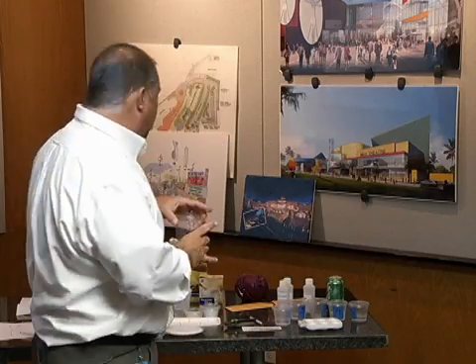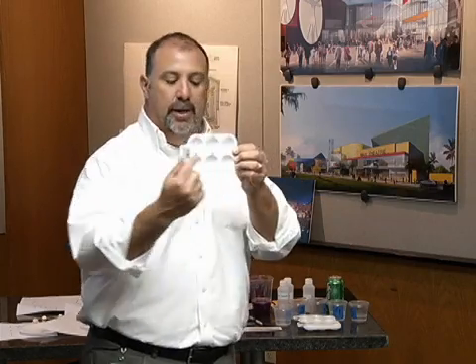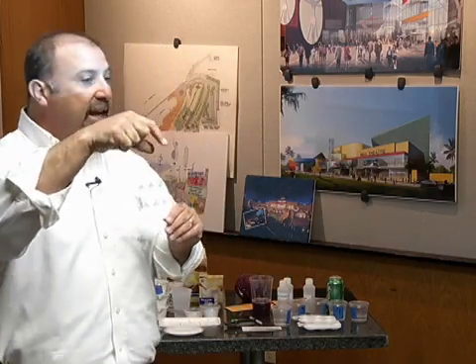You have these little paint palettes, and you're going to take the little grease pen and mark each of the little trays 1, 2, 3, 4, 5. That's going to correspond with the chemical. You're going to go around, and there are little droppers inside each of those chemicals. Try not to move a dropper from one chemical to another. There is a dropper for chemical number 1, a dropper for number 2, a dropper for 3, and so on.